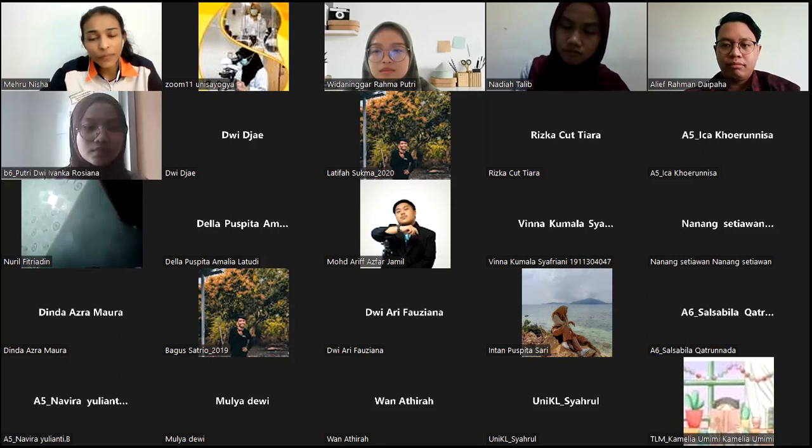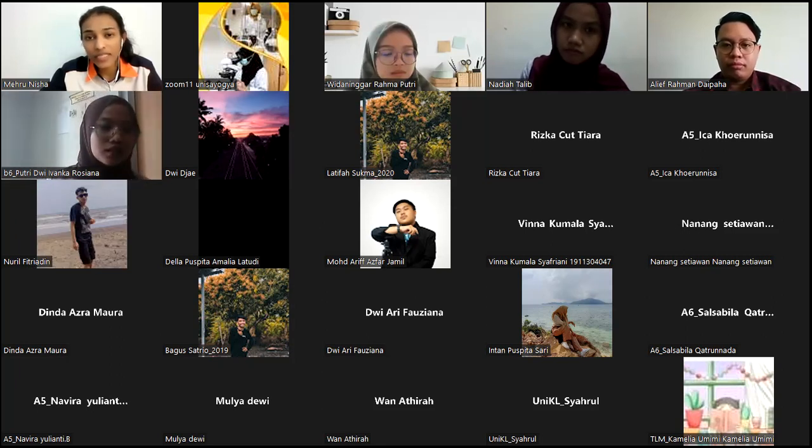Okay, thank you very much, Roshida. As I said, the LAMP assay is still under investigation. It is the latest technique developed, and research is still ongoing on whether it's sensitive or not. As you said, sometimes people think, why is it just a color change? Am I confident it's really positive or not? But it goes back to the primers that you use. The primers that we use in the LAMP assay are very sensitive.